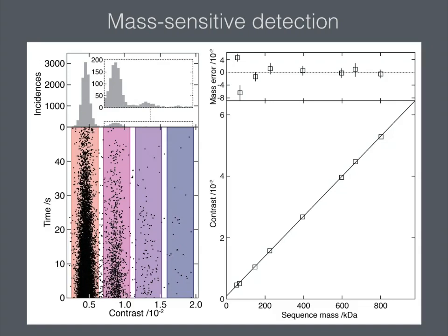So on the top here is the experimental histogram that we had for BSA, and you can see that though you're mainly monomeric, there are significant proportions of dimers, and if you zoom in closely, you can see some trimers and even some tetramers, even though the tetramers themselves correspond to less than 1% of the overall abundance in solution.